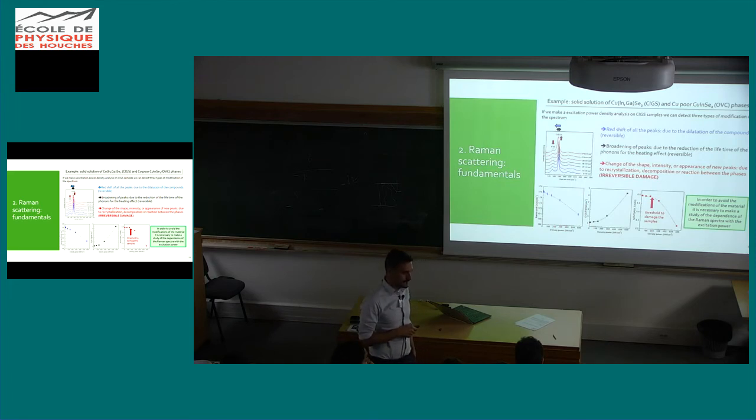And did you calculate the penetration depth inside the material? Because it's polycrystalline, it's really densely packed. So normally with green excitation in our absorber, copper indium diselenide or copper indium gallium diselenide, the penetration depth is around 100 nanometers, 150 nanometers maximum. The green is around 500 nanometers, or 532 we're using, something like that. So this penetrates around 100, 150 nanometers, so you don't really have the full depth of your absorber.